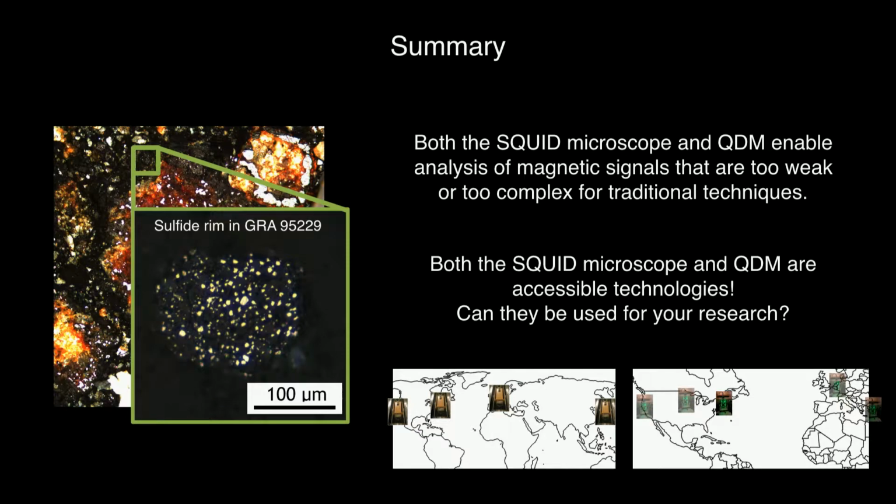A little point to emphasize is also a useful byproduct of the imaging: you can look for the spatial distribution of your useful signals, but you can also look for the spatial distribution of contamination. So let's say you prep a sample, and there's maybe some sort of glass mount that you're putting it on.